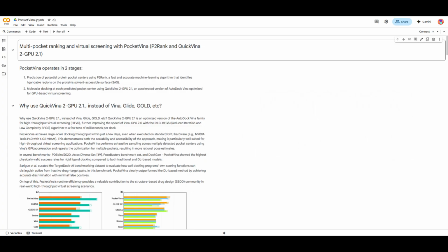Everyone, thanks for joining today. In today's video we're going to be discussing virtual screening and the use of machine learning in the detection of protein pockets for virtual screening. And today I'm going to be using a piece of open source software for virtual screening called PocketVina. Anyone who has done virtual screening before will most likely be aware of AutoDockVina, and PocketVina is a variation that is focused on using GPU acceleration.